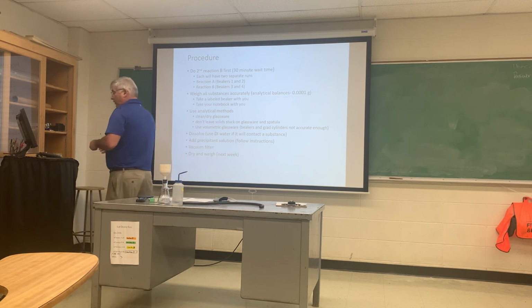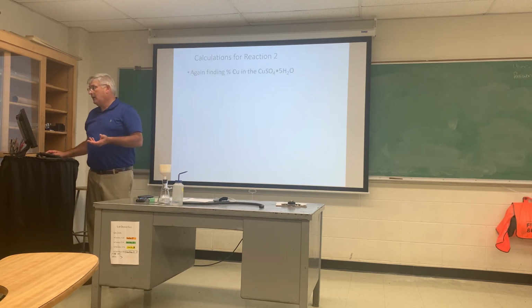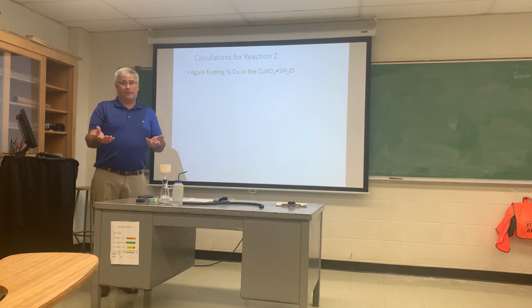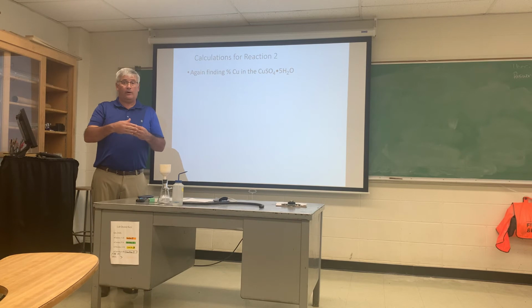All right, you're going to take your product and we're actually going to dry it for a week. So we're going to place that in your drawer on a watch glass on the filter paper, and you're going to have pre-weighed the filter paper so you'll know the weight before and after the compound has been put on it, and you'll calculate that in a week. That means the lab won't be due for 2 weeks, okay? You'll have to wait on that. But be aware, we will continue on and start a new lab also the following week, because it just takes a few moments to weigh.